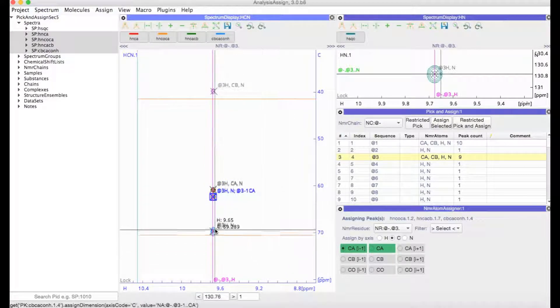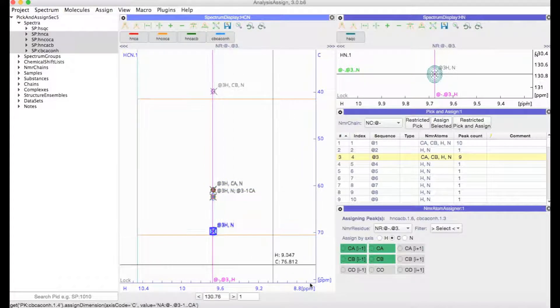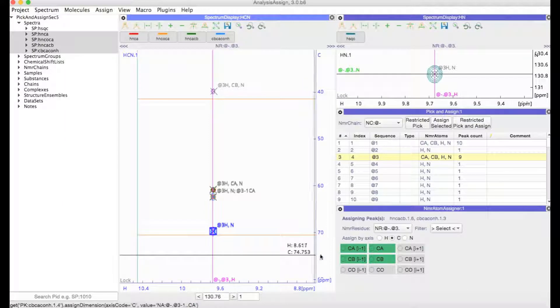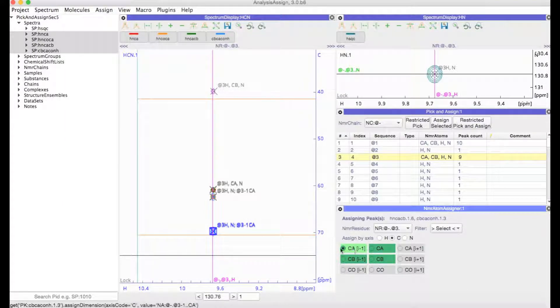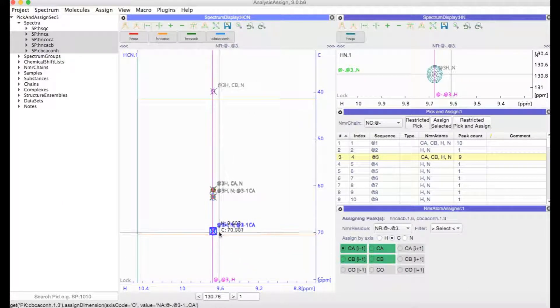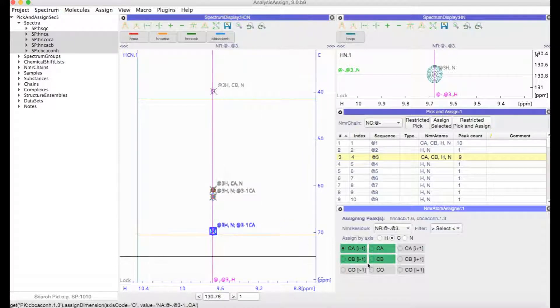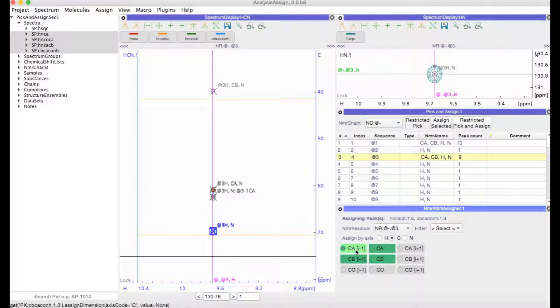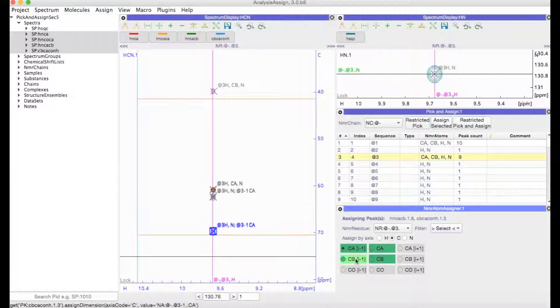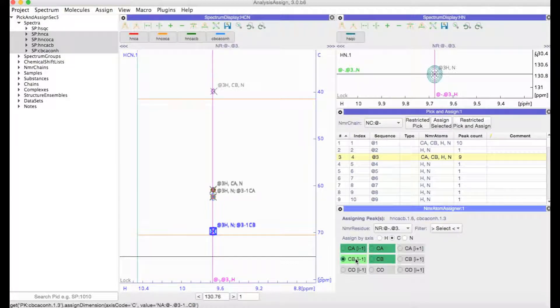Now if I were to make a mistake here, of course this is actually the I minus 1 C beta, I can either click on this again to remove it or I could just click directly onto the C beta to make that correction.